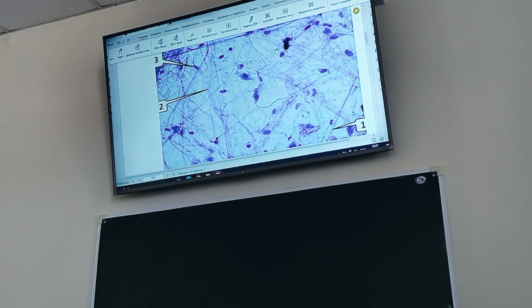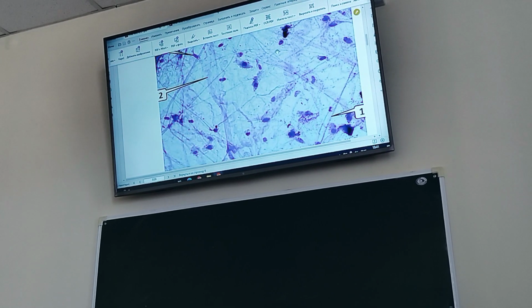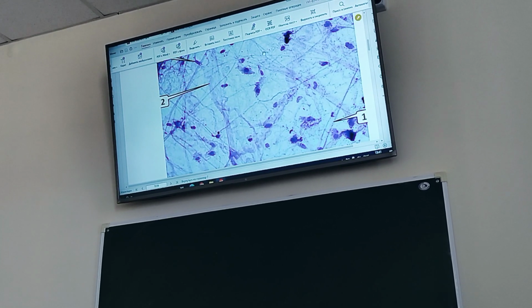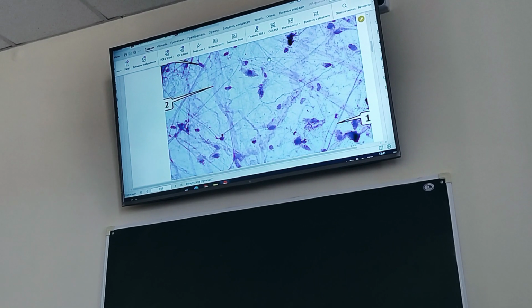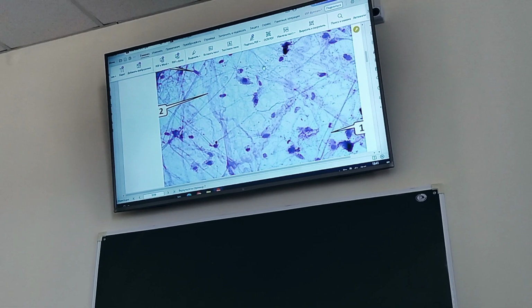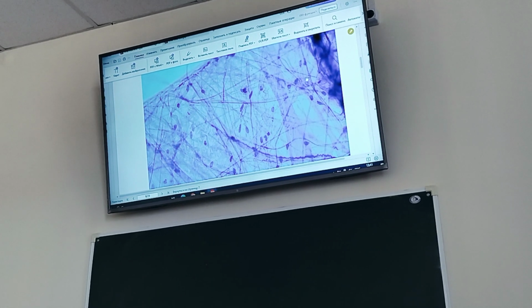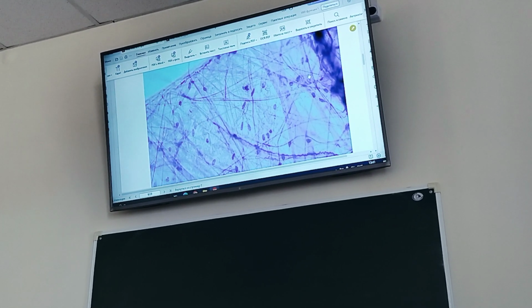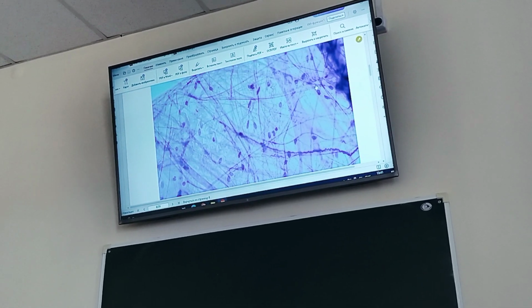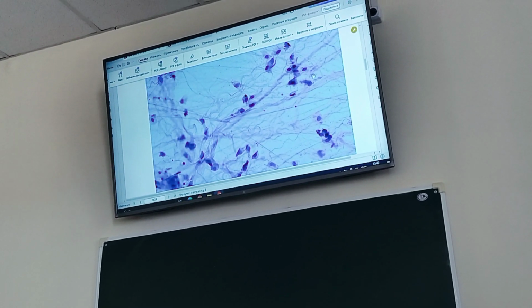This is again loose connective tissue. Fibrous. Subcutaneously, you can see different variants of the slice, a different appearance probably, but anyway, you can start with collagen fibers, elastic fibers, ground substance, and finally fibroblasts. The same: loose fibrous connective tissue, a little bit different appearance, but the same. And once again, loose fibrous connective tissue.